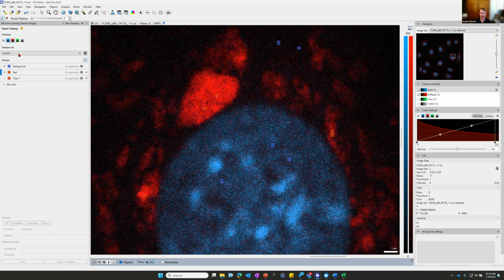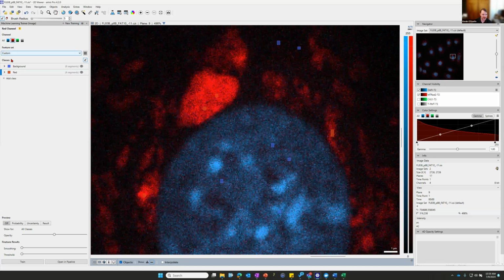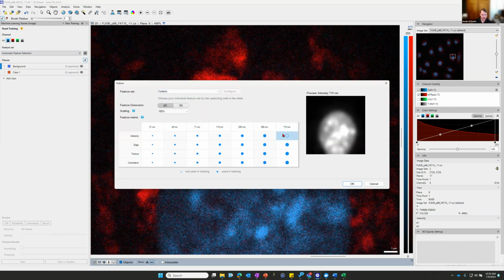Usually I just create separate trainings. So what I would do is have my one training for the red channel, and then I would do a brand new training just for this DAPI. I'll do it for this custom.